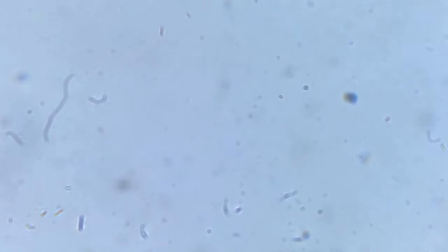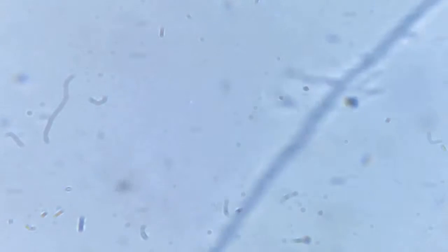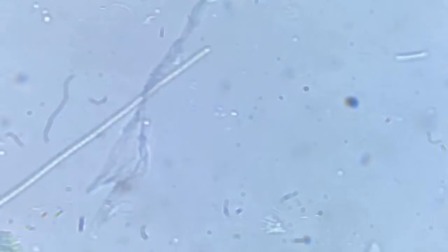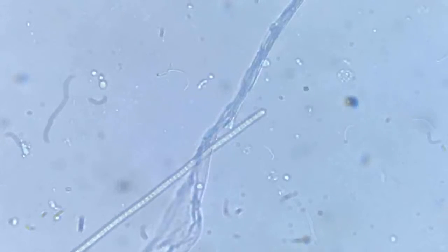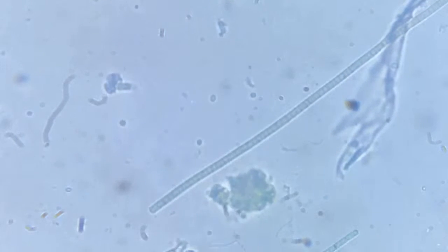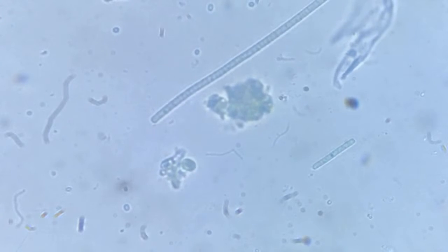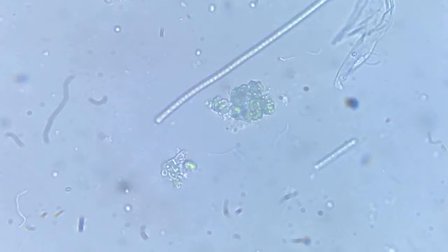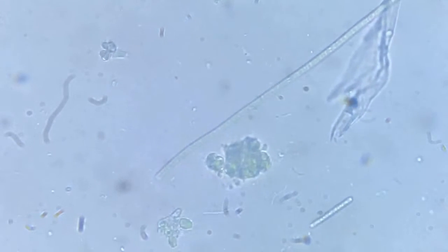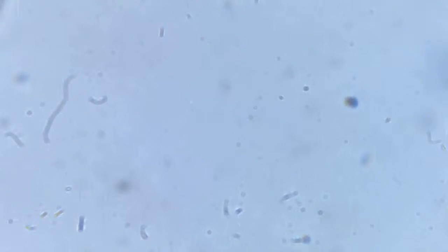What is this stuff? This is a filament of the algae, not that worm.